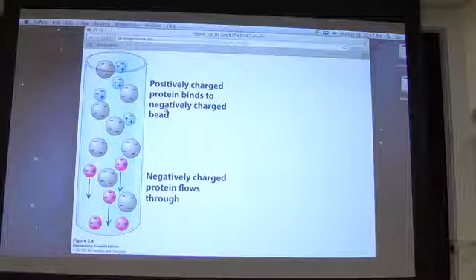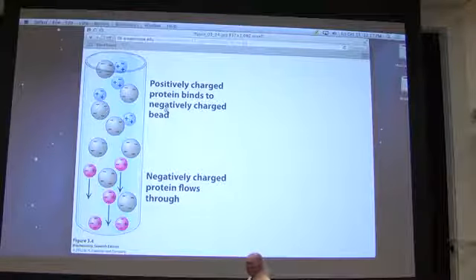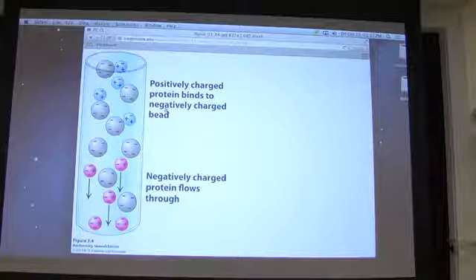Now, I think you can pretty well figure out what's going to be the difference between these two. If I'm doing cation exchange chromatography, the molecules that are going to travel the slowest through here are going to be the positively charged ones. The ones that are going to travel the fastest are going to be the negatively charged ones. And the ones in the middle are going to be somewhere in the middle of those charges.